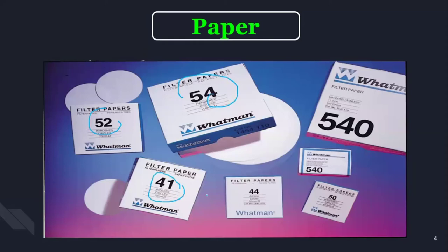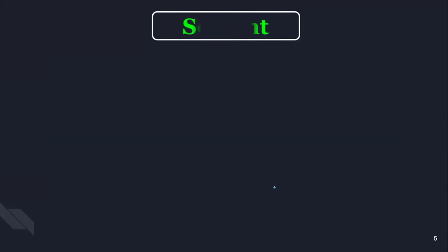So now, after understanding the role of the paper in paper chromatography, let us discuss the solvent. Now the solvent is generally prepared by saturating your organic solvent with water. Generally, we can call it a solvent in this particular system. Solvent here generally acts as the mobile phase. As I said, this overall technique is partition chromatography, which is divided into two phases: one is stationary and another is the mobile phase, in which our solvent acts as the mobile phase.